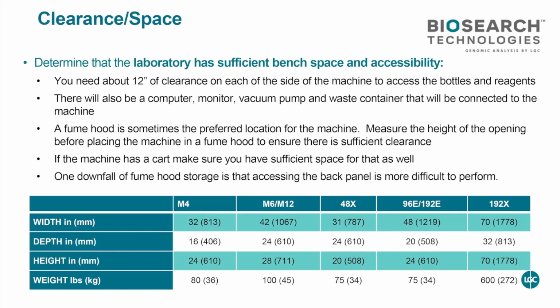So unless you put it in the hood, you can also put it on a bench or on a cart under a snorkel or a drop-down canopy, something like what you have in the kitchen over your stove, so that when you burn the eggs, the fire detection doesn't go off. Here's the width, depth, height, and the weight of each instrument.